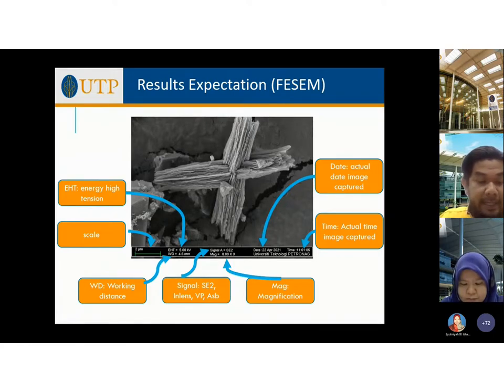The most important thing is the scale, which is at the left side. You have a scale here. This is very important. If you cut this off, your image is not valid anymore.